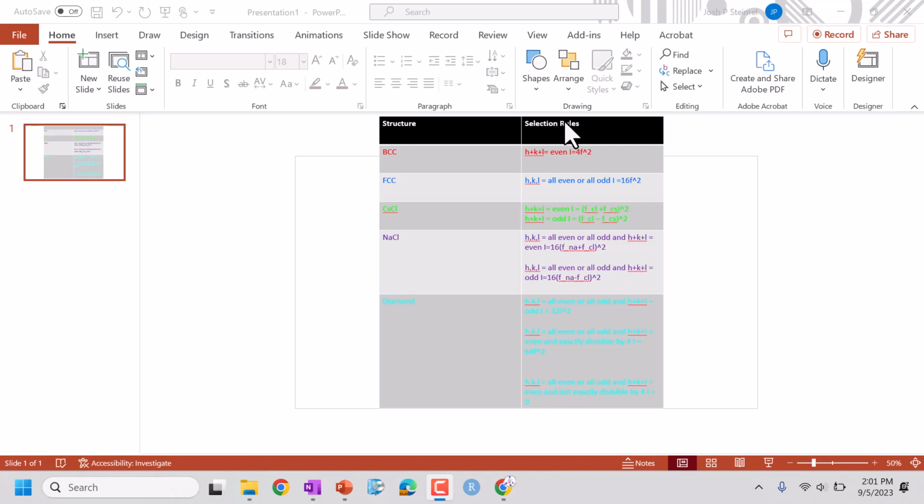Hey everyone, welcome back. I wanted to make this video just to give a little bit of a hint on a way that I would approach analyzing essentially this lab.